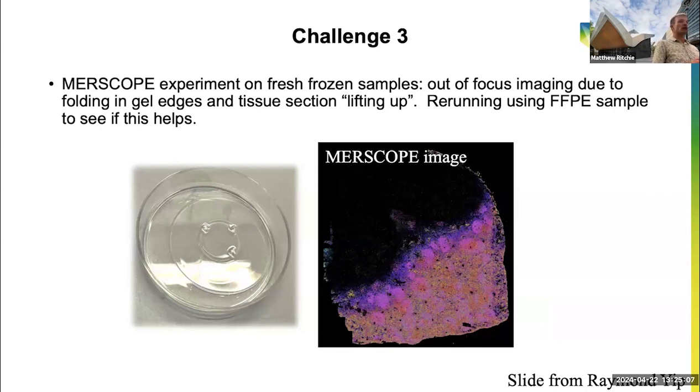Another technology we tried had an issue with getting the image in focus and having some gel lifting, which basically means all the bit that's lifted, you don't really get any signal from. So again, edge artifacts related to how you place the tissue, how you cover the tissue. And so, yeah, data there was not forthcoming on the first attempt either. But we're lucky the people in the lab are still optimizing many of these things. So I think there's hope that there'll be data from other platforms soon.